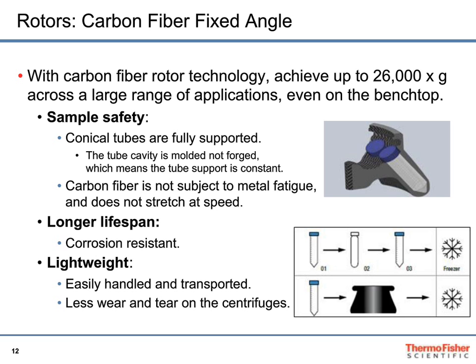Now, obviously, if you want to do anything other than ambient temperature, then you're going to need a refrigerated centrifuge. But the good news is these days, so many of these centrifuges have been doing this for so long that it's a well-established technology to be cooling chambers, cooling samples. But one thing to understand is it's a little different because now the chamber is going to be sealed. You don't want ambient air coming in there. It puts stress on your refrigeration system, may make it so you can't cool as far as you want to.